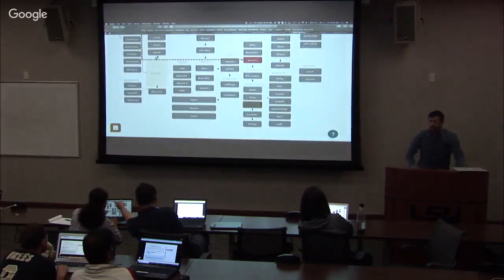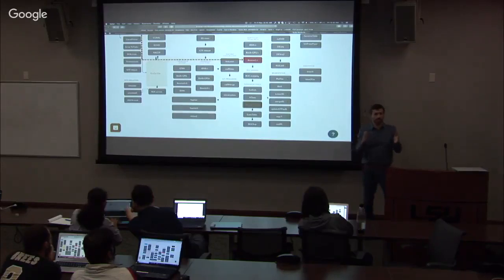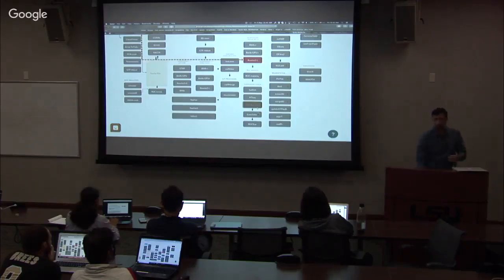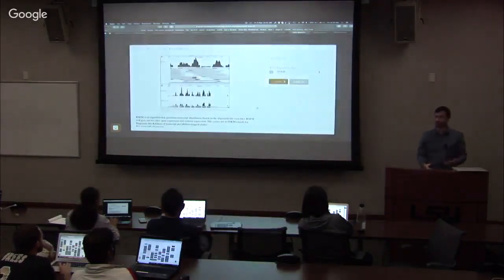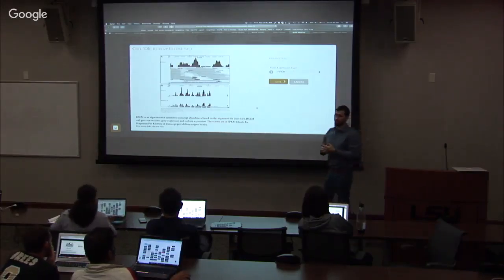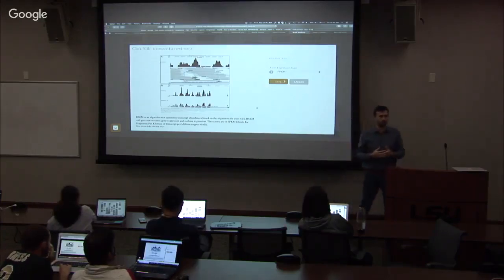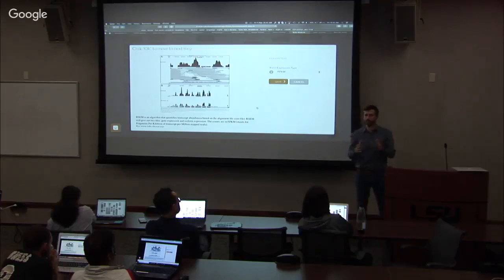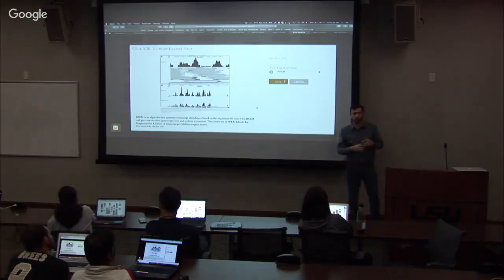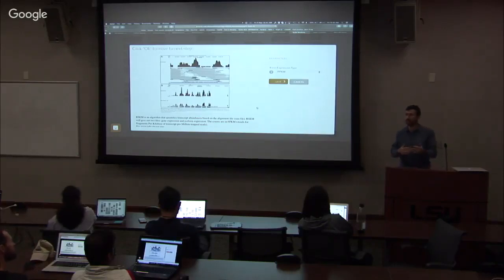Save, and after I've aligned those reads to my genome, I need to count, in this specific segment, how many are stacked up together. To do that, it's actually a non-trivial procedure called RSEM. What RSEM does is it analyzes the overall statistical distribution of reads and counts in terms of how many fell together, not by chance, right? So we don't just count how many, we actually have to use the overall distribution of reads for the whole transcriptome in this case, and then count accordingly.